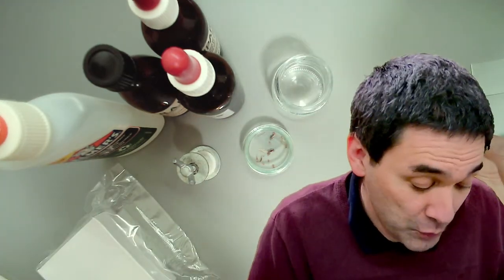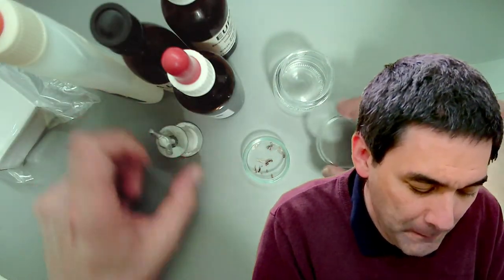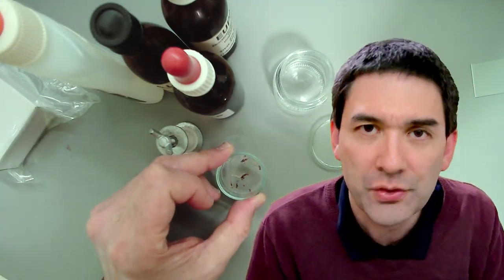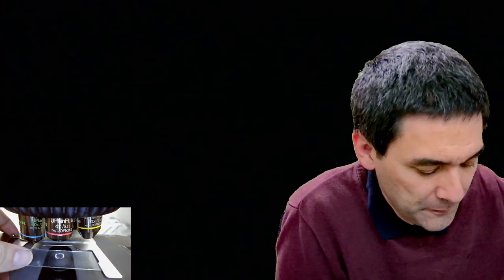So I'm just going to do the following. Before I start making it, I would like to show you how those mites and bee legs and bee wings look under the microscope with light coming from the top. Okay, so I have to switch over to the microscope scene, and you see over here, as always, the stage, and the only thing that I'm doing right now is I'm going to simply take the little petri dish that I have here. Okay, I'm going to put it directly on here. And of course, you're not able to see anything because it's too dark, but I've got a flashlight here. It's a pretty strong flashlight.